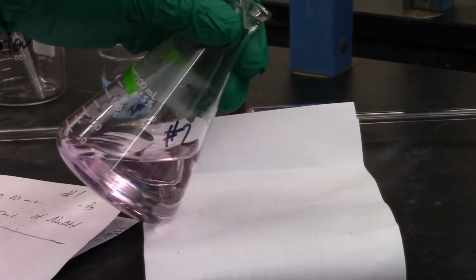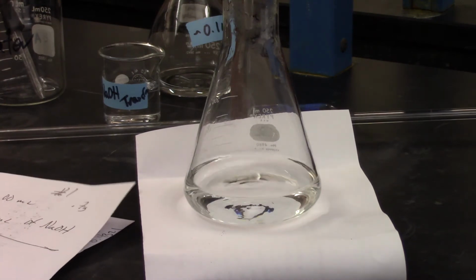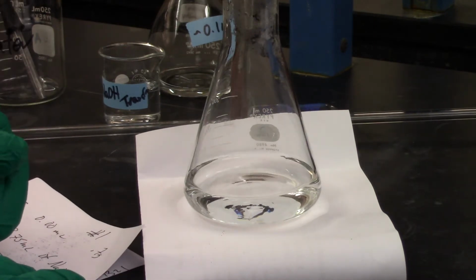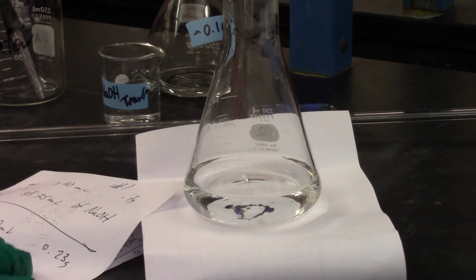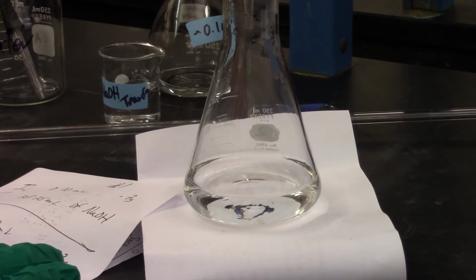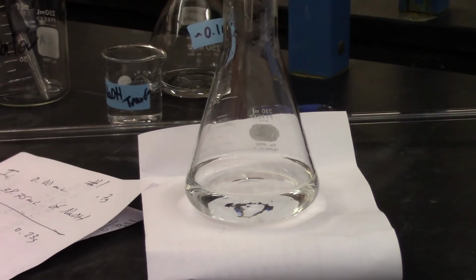Going from there, I've got number 3 ready to go. Rinsing the sides of my flask, and I'll get that under there. Now, because I only used about 12 mils, and I had about 0.23 grams, for my third, I'm starting at 11.90 mils. Zoom out a little. Starting at 11.90 mils.